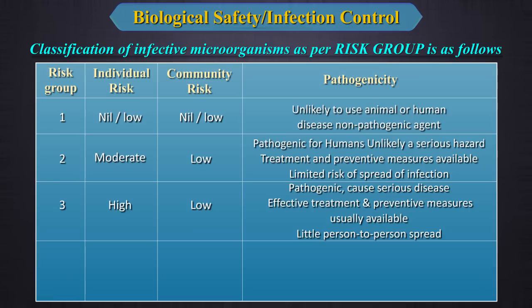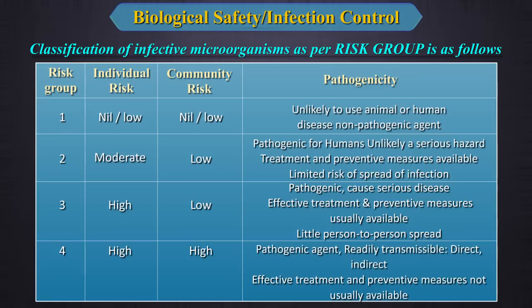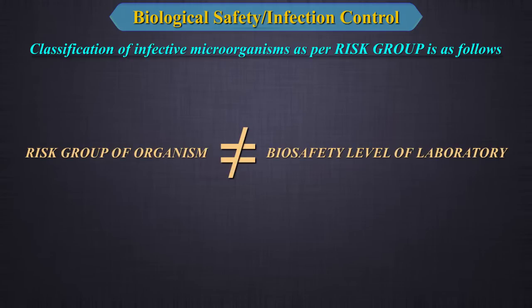Risk Group 4 means both individual and community risks are high. The pathogenicity indicates a lethal pathogenic agent that is readily transmissible — directly or indirectly infective — and effective treatment and preventive measures are not usually available. Note that the risk group does not equate to the biosafety level of the laboratory.